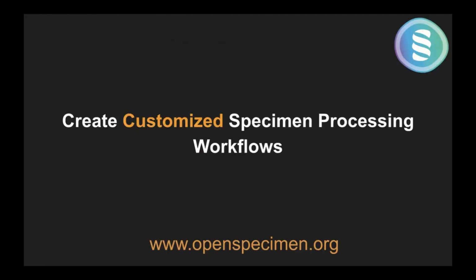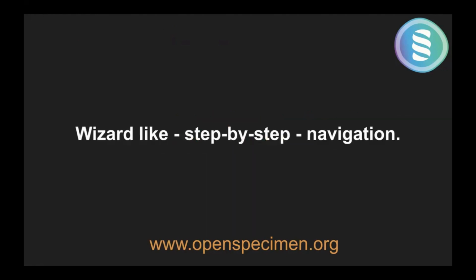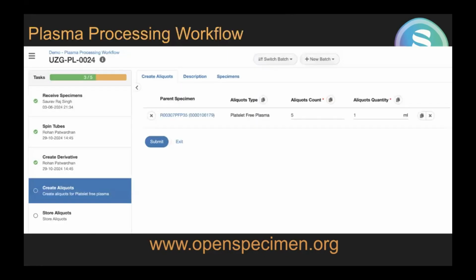You can create customized specimen processing workflows. Basically, it helps you to capture the end-to-end work in the journey of a specimen. And it's a wizard-like thing. It's step by step. So, for example, you see here that this is a plasma processing workflow. So, you start with receive specimens, then you spin, then you create derivatives, then you create aliquots, then you store.